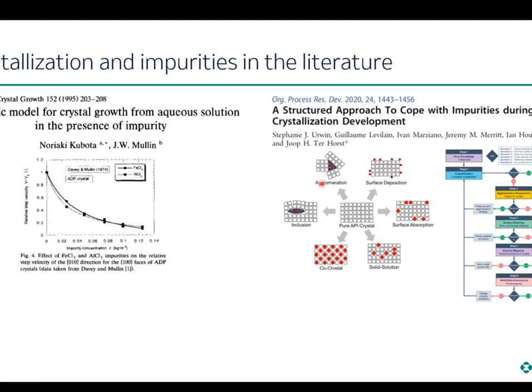They give a nice overview of the different possibilities for how impurities can be trapped inside an agglomerate, inside the particle, inside the crystal lattice, but also on the surface by adsorbing to it. They've also developed a pathway to identify which of these phenomena is actually occurring, and with it the strategies to get rid of them.